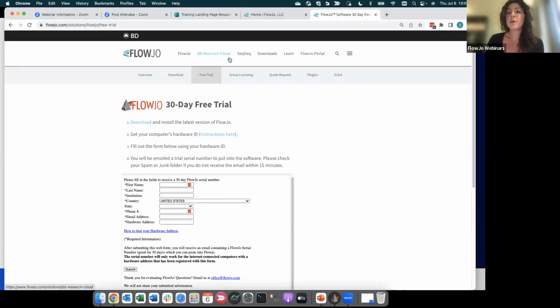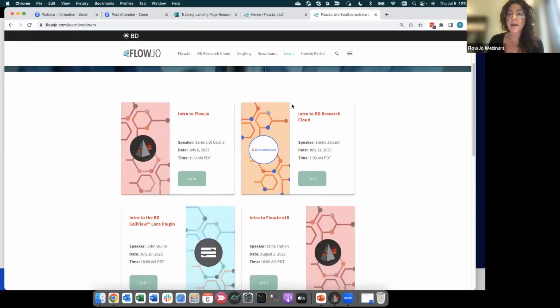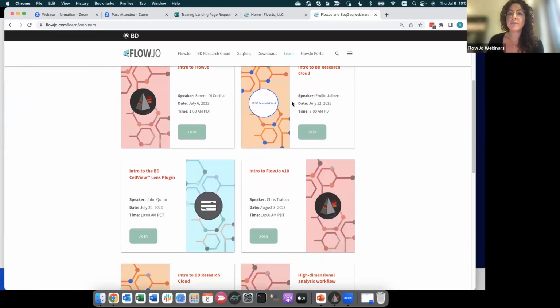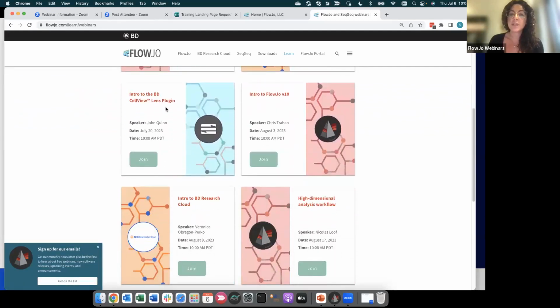The most important part, I believe, of the FlowJo website, is for sure the Learn area. Everything I will show you today can be found within the Learn area. First of all, we have the webinars area, so you can sign up for the next upcoming webinars. This is the webinar of today, and then we will have a webinar for BD Research Cloud, for the CellView Lens plugin, and so on.